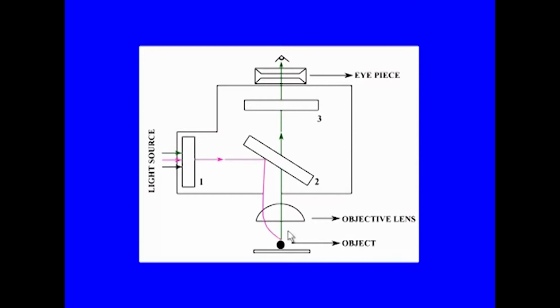and emits a longer wavelength or fluorescence, and that fluorescent wavelength passes through the dichroic mirror without any problem, and then it passes through this filter, which is the second barrier filter, and allows only specific green fluorescent emission between 520 and 560 nanometer to pass through, and so unwanted signals are cut in here, and then you can either observe it through eyepiece or it could be recorded. So, this is typical optics of epifluorescence microscope, where like I said, observation and emission is recorded from above actually.